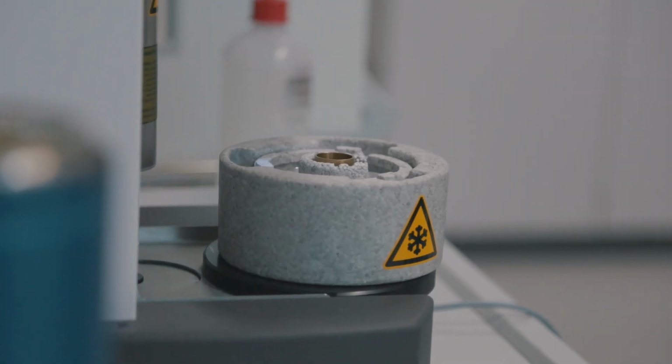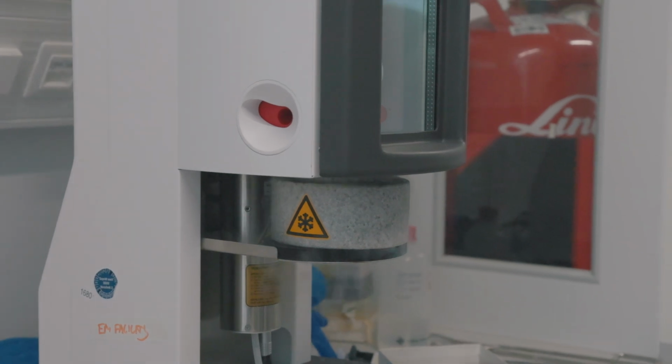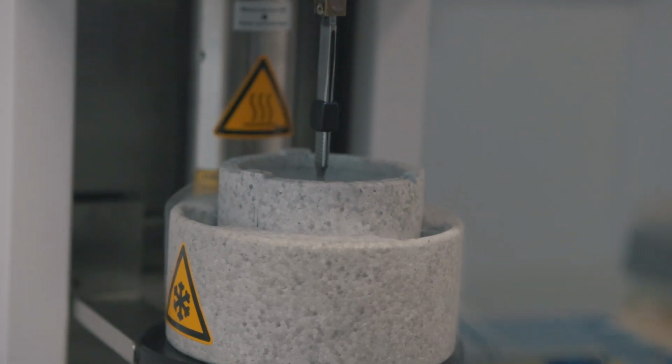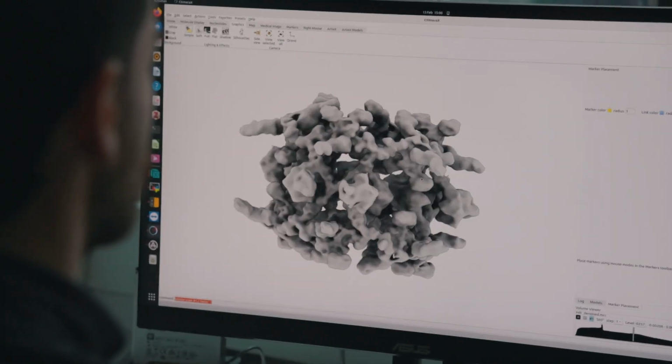Cryo-electron tomography is a great technique that allows you to span the scales from individual protein structures down to the overall cellular context. And the way it works is you freeze your cells, so you preserve the native environment that they were in. Then you need to thin them down so that they are essentially transparent to be seen with the electrons that we use to image them. And then we reconstruct a three-dimensional volume of the interior of the cell.